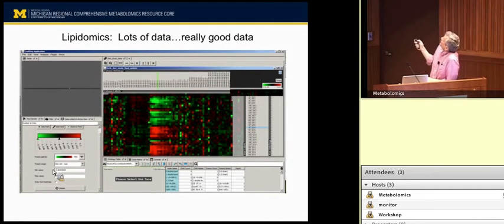This is just looking at the same PCA plot differently. This is a radar, and we're looking at this little piece. This is how much data is there, and I'm just focusing on one because it's a pretty picture, sort of your Christmas colors. One of the things I want to point out is that you can rapidly see here: this is baseline, visit 1, visit 2, after 21 days of PUFA, after 21 days of carbohydrate diet, and then the people with non-alcoholic fatty liver disease are down here.